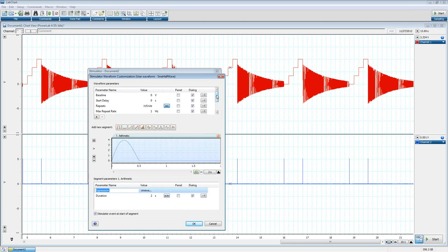You can see here, if I go up to the waveform parameter, I can actually create custom variables that I can change or have default values, so I can change them later on in the expression. So I'm not giving a constant in here. I can change it on the fly, like say out in the stimulator panel, and change how things work. So amplitude, of course, is going to be the amplitude of the sine wave. I have it default to 5 volts.